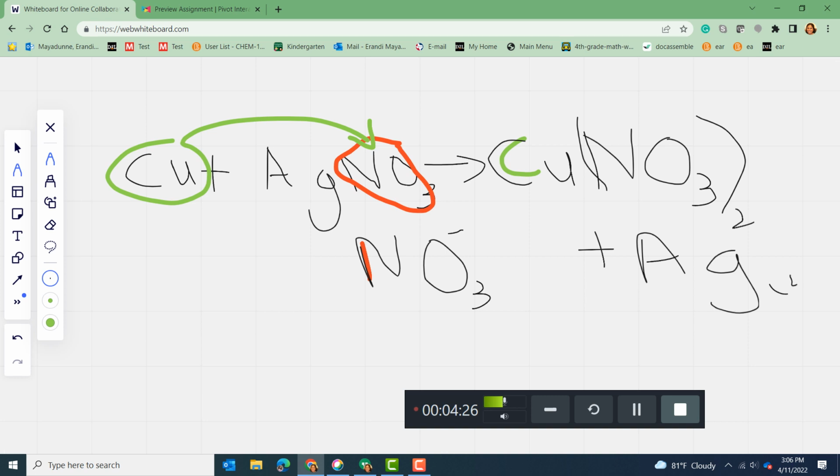So in this reaction, this is solid, not aqueous, sorry. At the beginning, you put the solid copper into the silver nitrate, which is a colorless liquid, and you get copper nitrate. Copper is the copper 2 plus ion in water, so you will see the solution is a blue color, and then you see the silver solid coming out from the reaction.